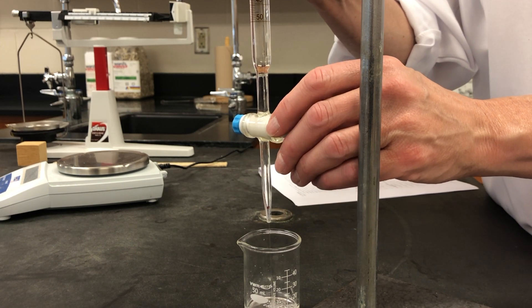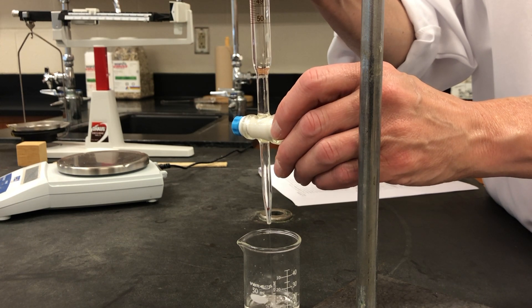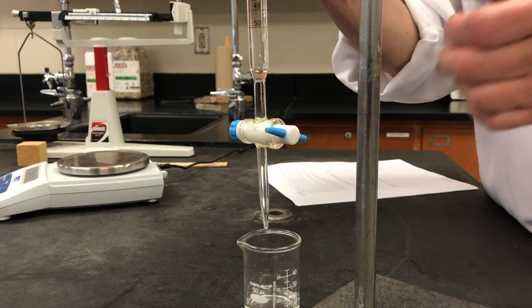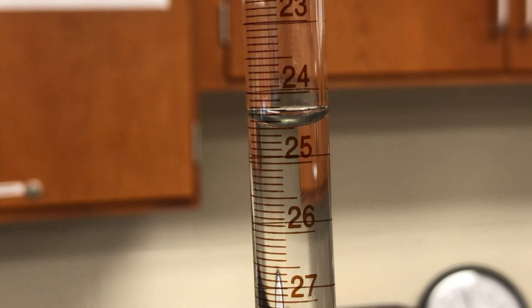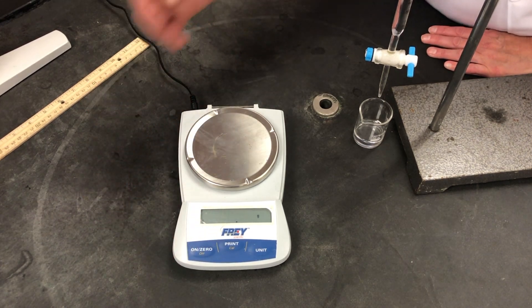Our goal is to add about 15 milliliters of water to the beaker. Since we started with an initial volume of about 10 milliliters, our final volume will be close to about 25 milliliters. Notice how the stopcock is perpendicular to the buret — as we turn it, we make it parallel to the buret, which allows water to be dispensed from the buret into the beaker.